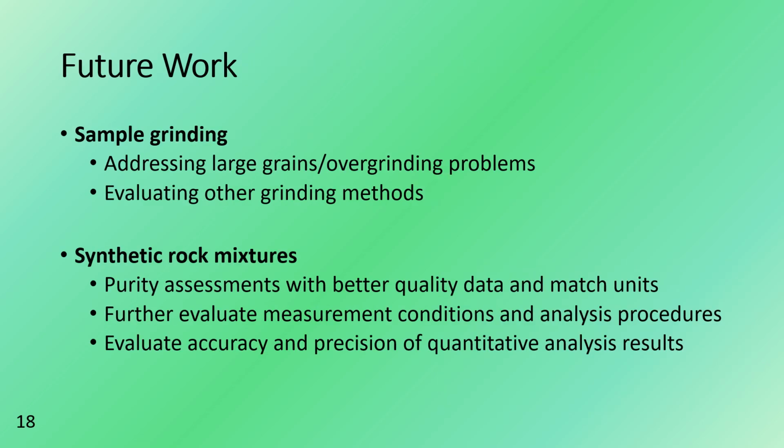And then future work, so what's next? With sample grinding, there's many options to explore, including addressing large grains and overgrinding problems and evaluating other grinding methods as well. And then with synthetic rock mixtures, those are really the next step with XRD measurement and analysis methods evaluation, but that comes with the necessity of doing purity assessments with better quality data and match units.